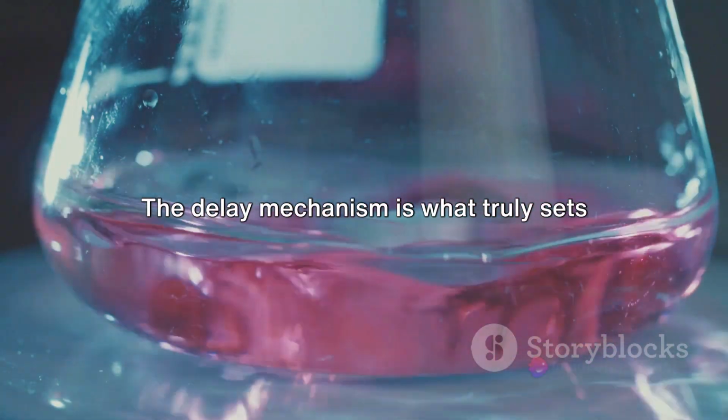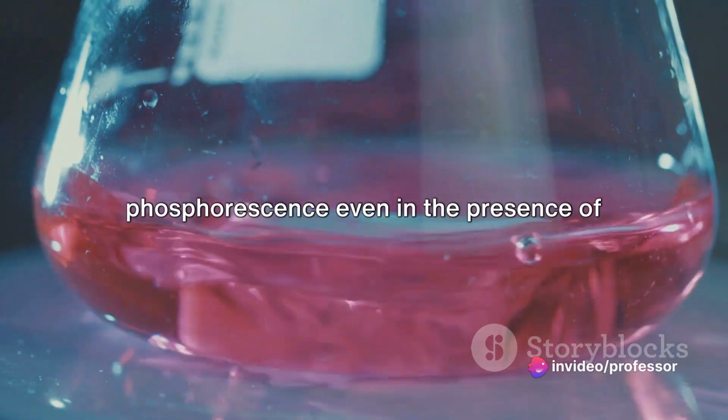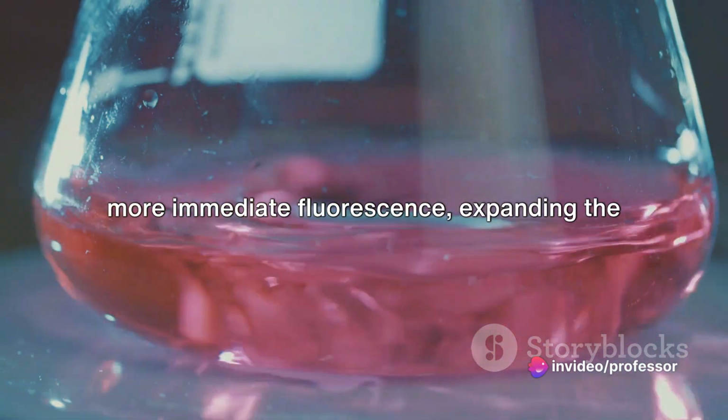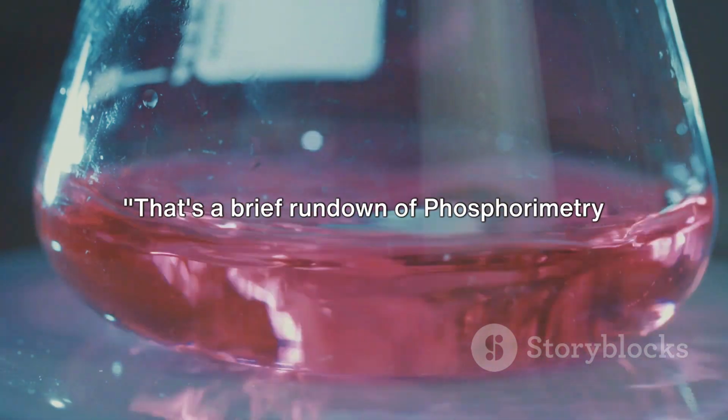The delay mechanism is what truly sets phosphorimetry apart. It allows for the measurement of phosphorescence even in the presence of more immediate fluorescence, expanding the range of molecules and environments we can examine.